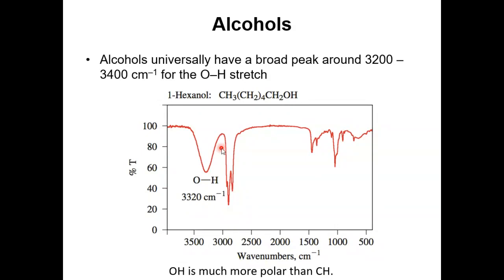CH usually doesn't vary much, okay? But the OH peak can vary a lot, and for a given compound it can vary a lot. It depends on concentration and on your environment. But if it's CH and the compound is given, the chemical shift value usually doesn't change much. But why can the OH chemical shift value change a lot? Anyone recall from proton NMR?